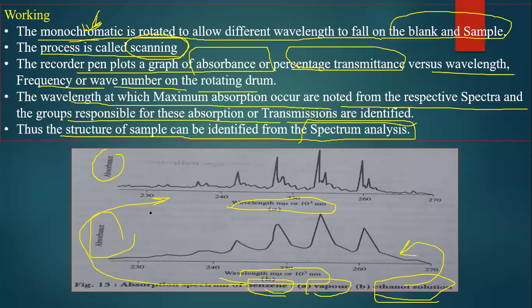So if I analyze benzene today, and again I analyze benzene tomorrow, whether it is analyzed in Nasik or in Khed, wherever it may be, if experimental conditions are maintained the same, it is going to give you the same signal. From this you will come to know which peaks are obtained for which compound at a particular temperature. That helps us in qualitative analysis, and it also helps in quantitative analysis.